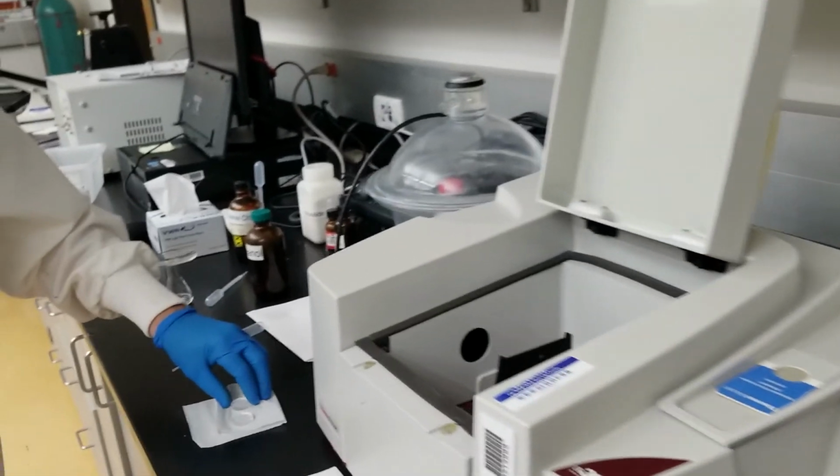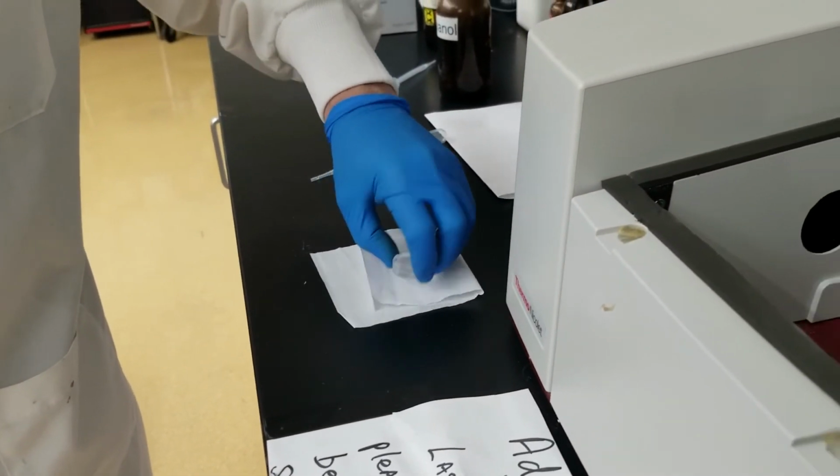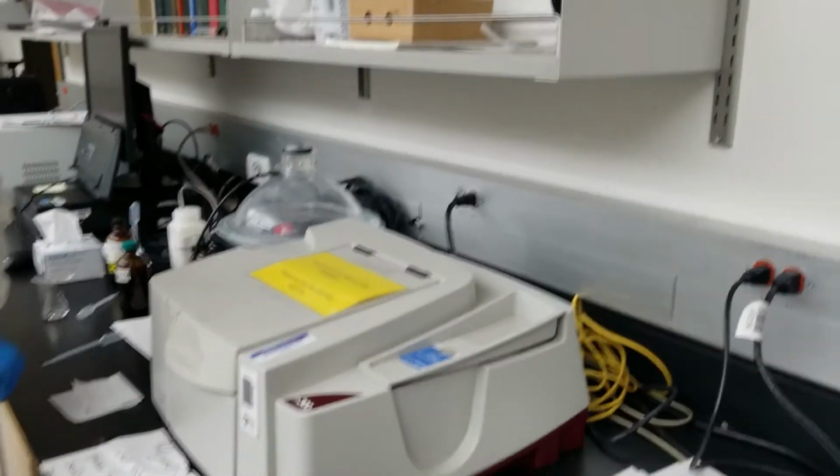So we put a little bit there. We're going to take this and sandwich it on there. It looks nice and full. We're going to drop that right on our sample holder, right there. Notice I was touching the edges, and I have gloves on so we don't get any finger oil in there. We're going to shut that down.